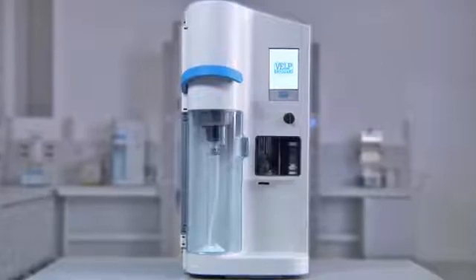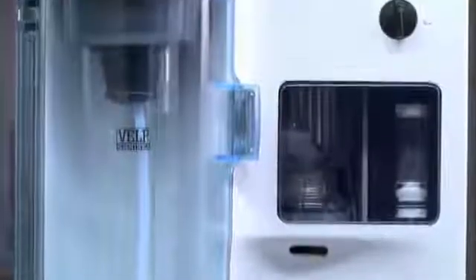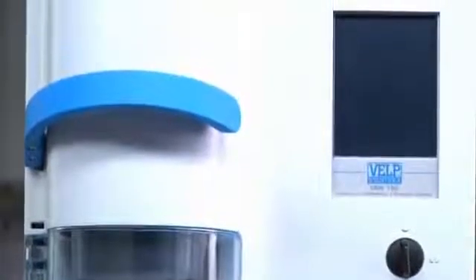UDK 159 Automatic Distillation and Titration System. VELP Scientifica offers a comprehensive solution for the determination of nitrogen, protein, and other components with its range of modern Kjeldahl systems responding at a variety of levels to the steps of digestion, distillation, and titration.